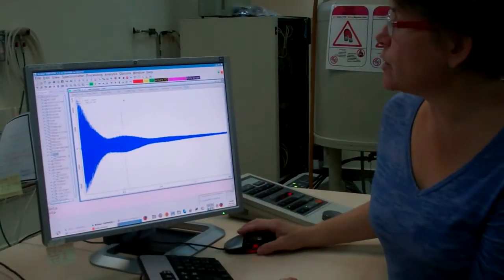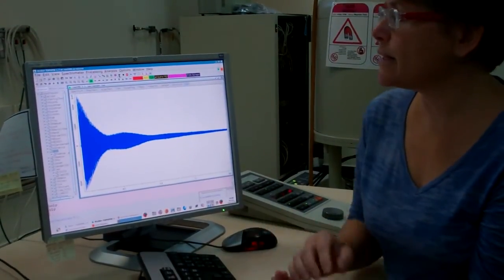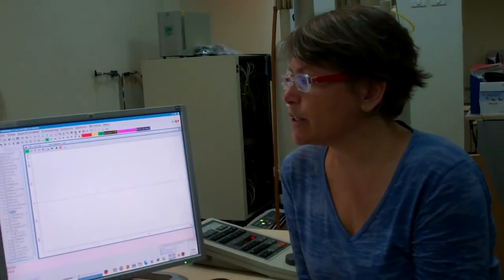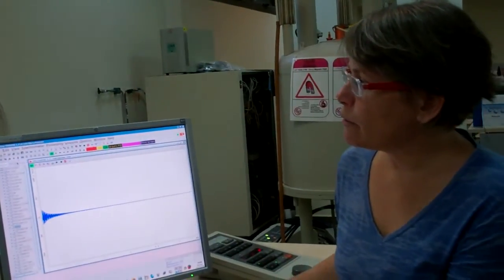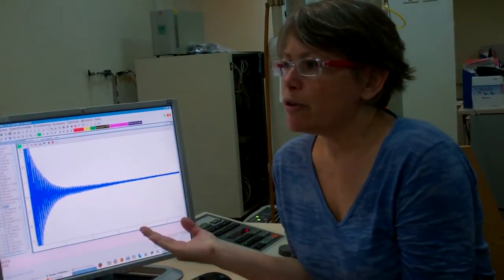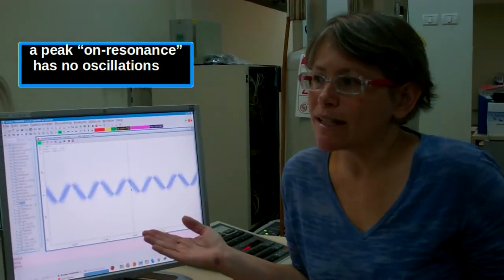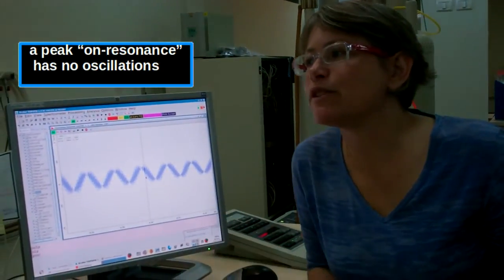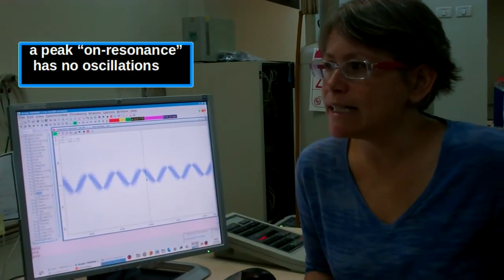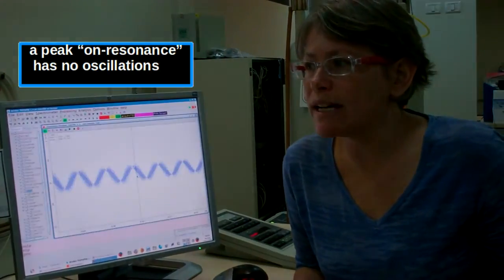Let's start the acquisition by pressing play. The first thing you'll notice is that inhomogeneity from our previously acquired acquisition should now be replaced by a more exponential decay after our shimming. And here's our new acquisition time on our x-axis. Here's a zoom to see the oscillation frequency, which is the difference from the center frequency. The difference is taken after the signal is detected, but before it is digitized.